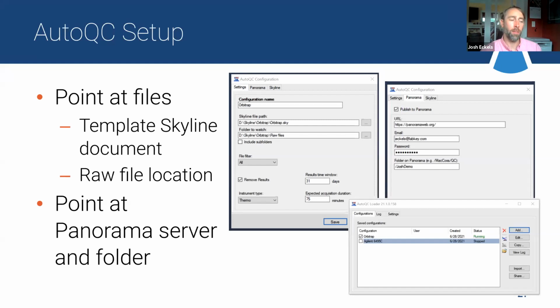But you could have users who are editors who are allowed to, say, upload new Skyline documents or delete a Skyline document that got dropped in the wrong place, something like that, versus just readers. So a reader is going to be able to see everything, but not mess with the guide set, not disable a metric, that kind of thing. So I think it's basically edit access versus read access, not a separate admin.